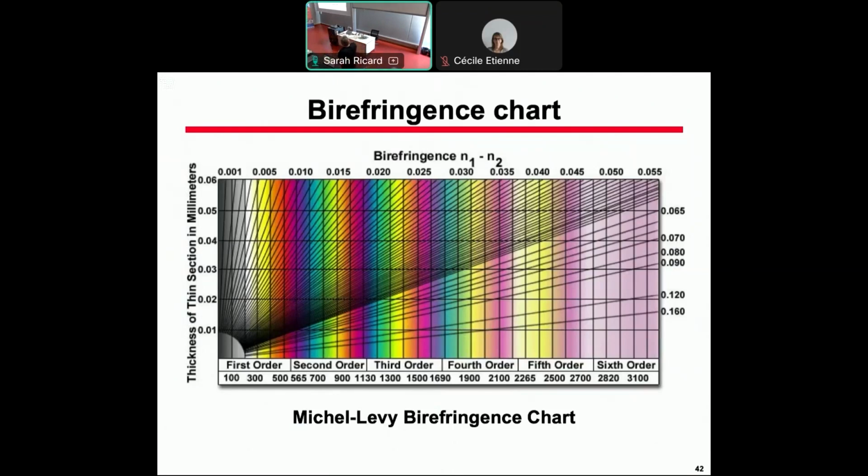And there is a big drawback. When the optical path difference is very small, in fact, you have gray levels. Your eye is not good at distinguishing gray levels. It's good at colors, but not gray levels. So it was almost not used for biology, because in biology, at the cellular scale, you see almost nothing.